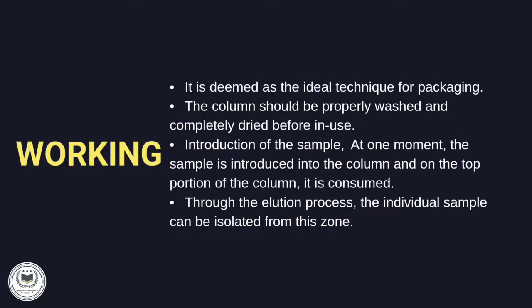And then comes introduction of the sample. The sample is a mixture of components which is dissolved in the minimum amount of the mobile phase. Once the sample is introduced into the column, it is adsorbed on the top portion of the column. Through the elution process, the individual sample can be isolated from this zone.